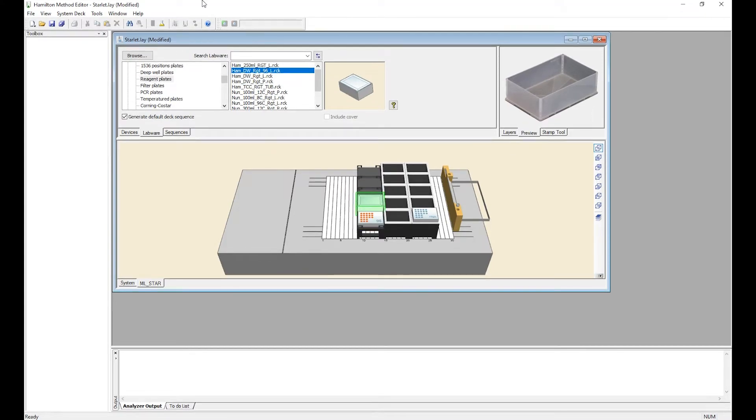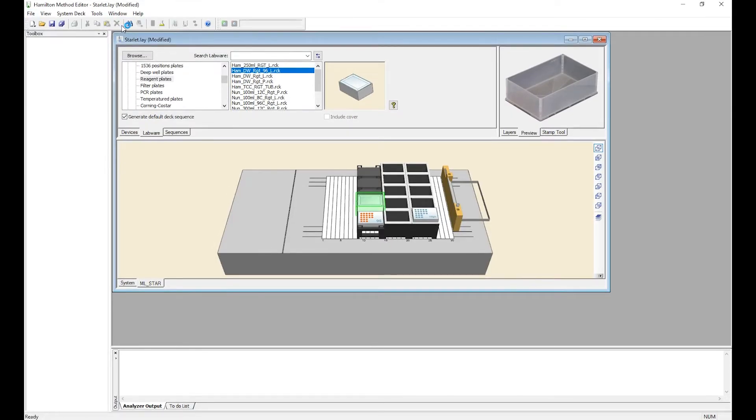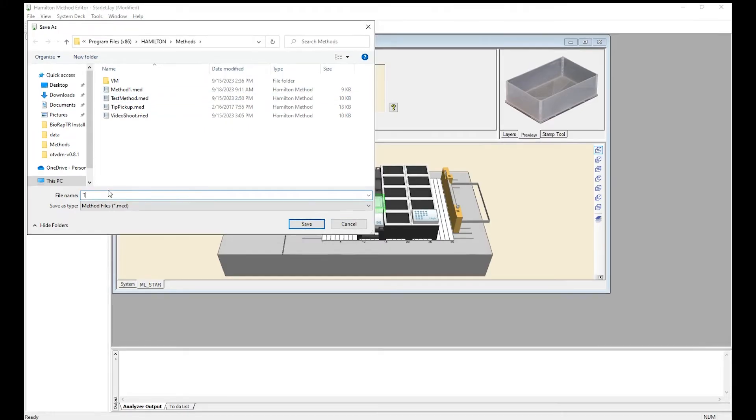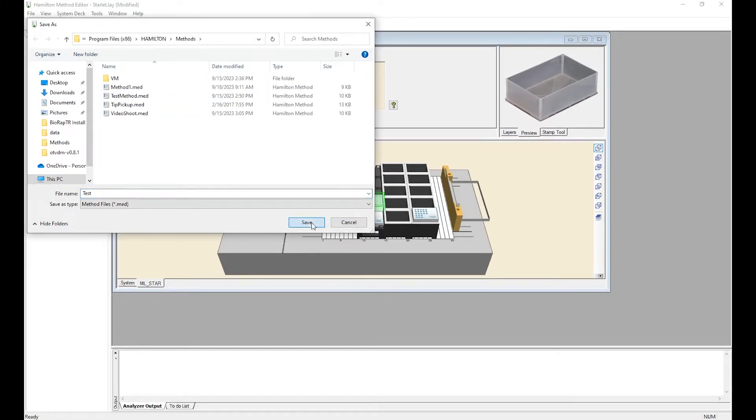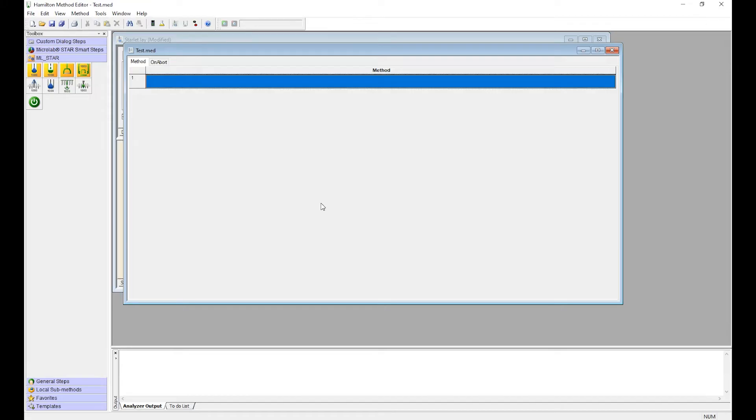Now that we have our labware set up on the deck, we're going to create the method. So go to File, New Method. Give it a name and save it. The method editor should open and now you can begin creating your method.